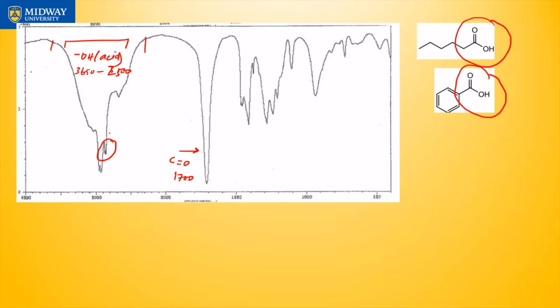So same thing, this has the CH peak, right? Because like I said, when you have a benzene ring, there's a higher chance of it having it, unless, like I said, if this molecule had been looking like this, then maybe you can argue that it was not there. But what other way can we conclude?